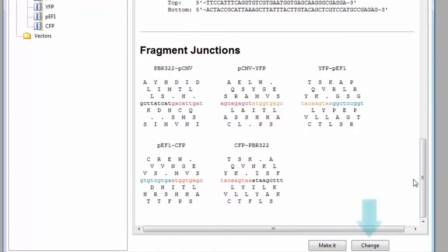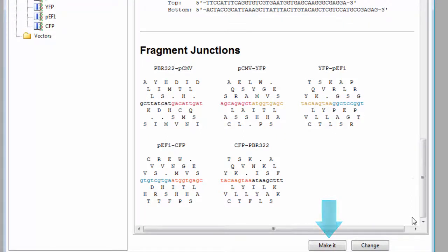Click the Change button to return to the Clone tab to make changes, or click Make It to proceed with the cloning simulation.